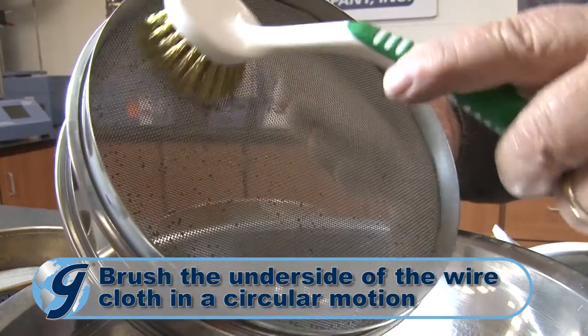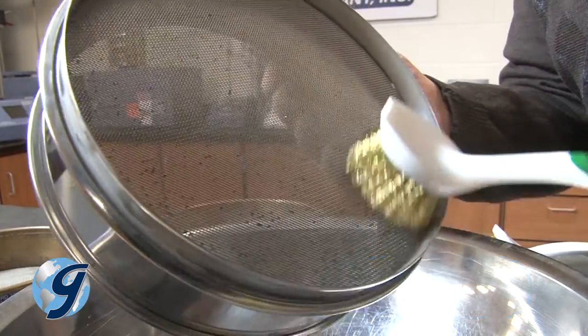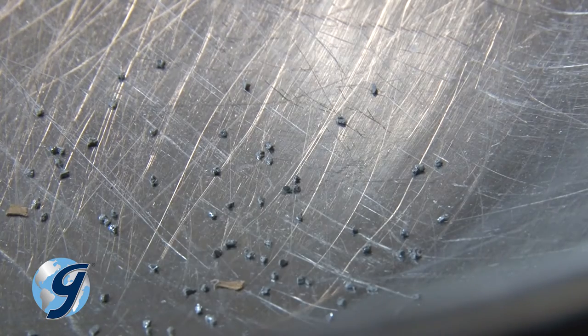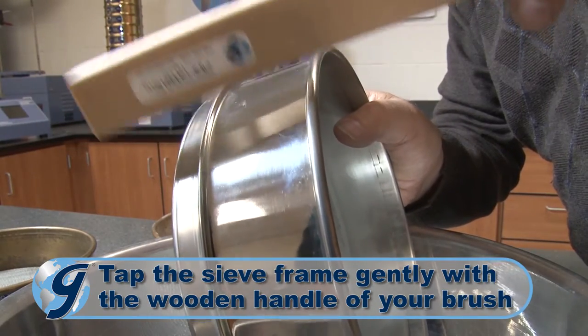Brush the underside of the wire cloth in a circular motion, exerting light pressure to dislodge near-sized particles. Tap the sieve frame with the wooden handle of the brush to dislodge particles.